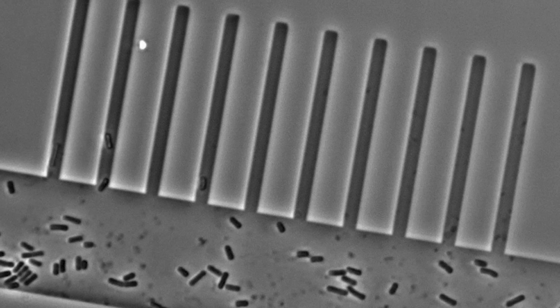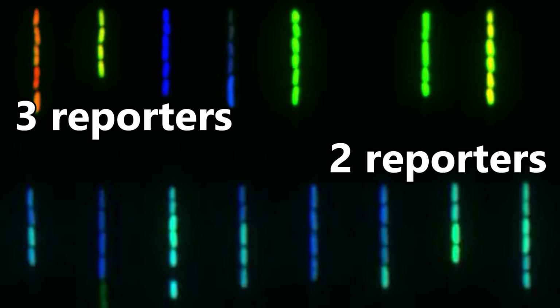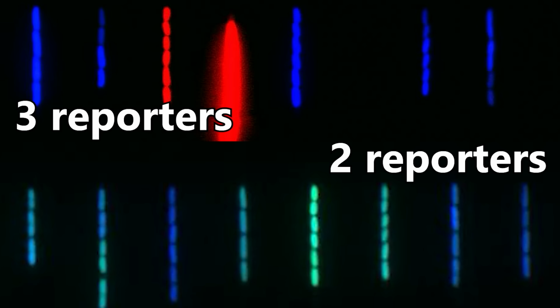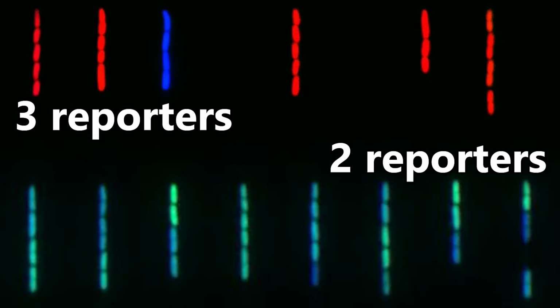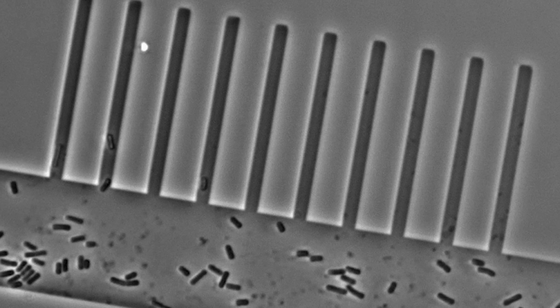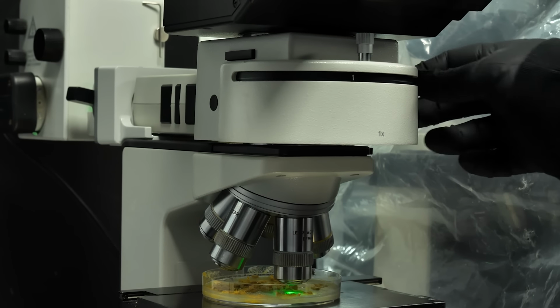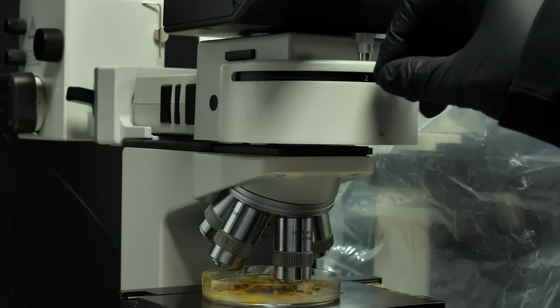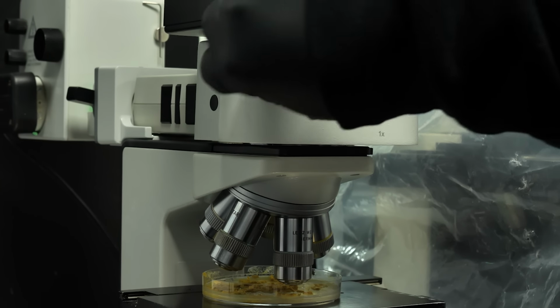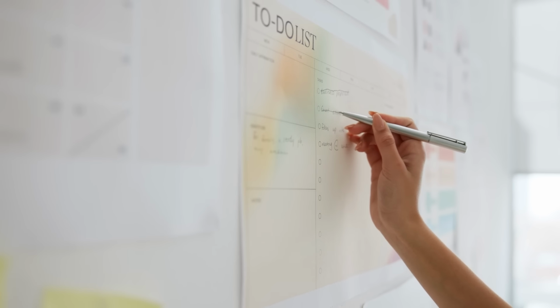One of the cool tricks that the authors used were these special microfluidic flow cells that allow you to follow the lineage of a single bacteria as it grows, divides, and pushes the daughter cells out the little tubes. And you can see that the bacteria literally oscillate colors as they grow. Unfortunately, I don't have the special microfluidic system, and my microscope, while wonderful, is very clunky and shaky switching between the color channels. So I'm going to need to build a special rig to record a time-lapse of this properly, but that'll have to be for the future as it's a rather involved build.